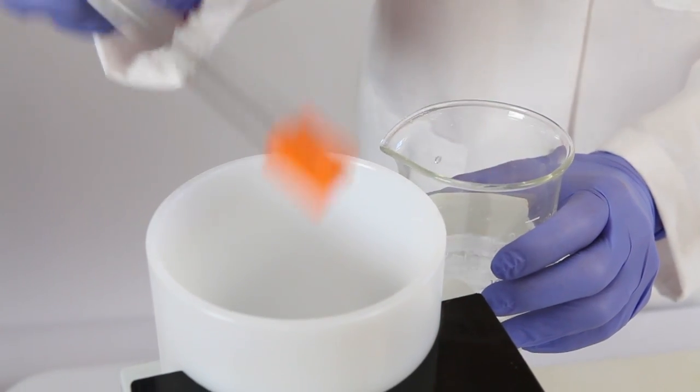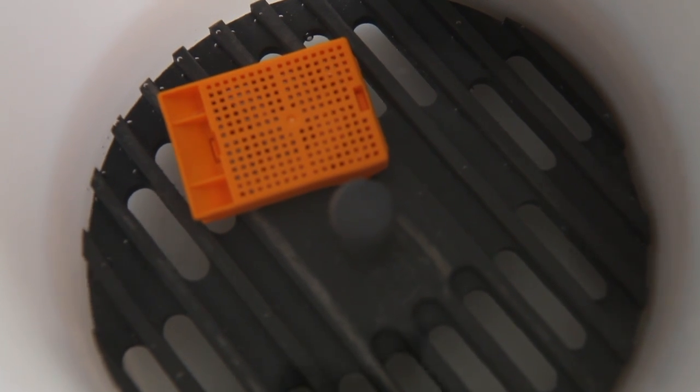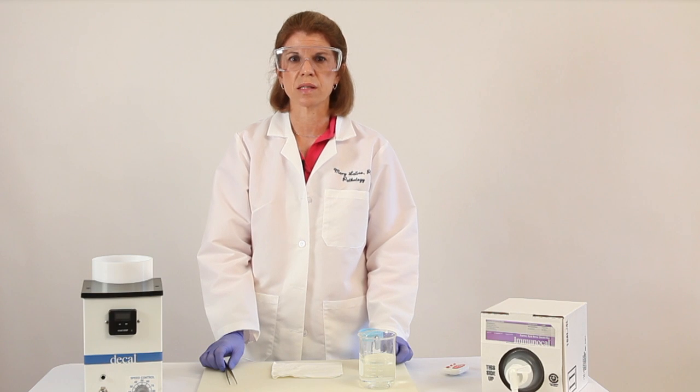So now I'm going to put the specimen into Immunocal. I use a magnetic stirrer with a bar that constantly spins. It keeps the solution moving, so more ions make contact with the specimen, which speeds up the process.